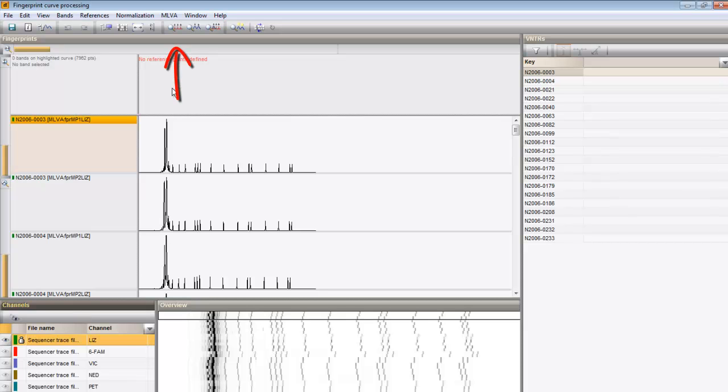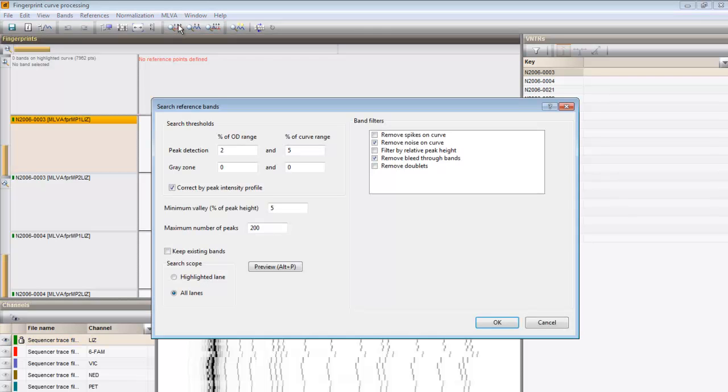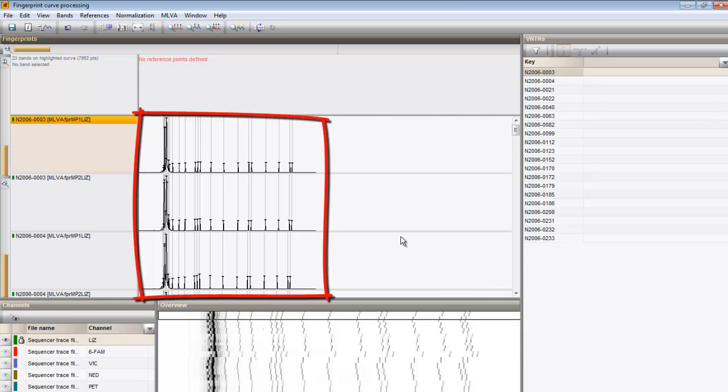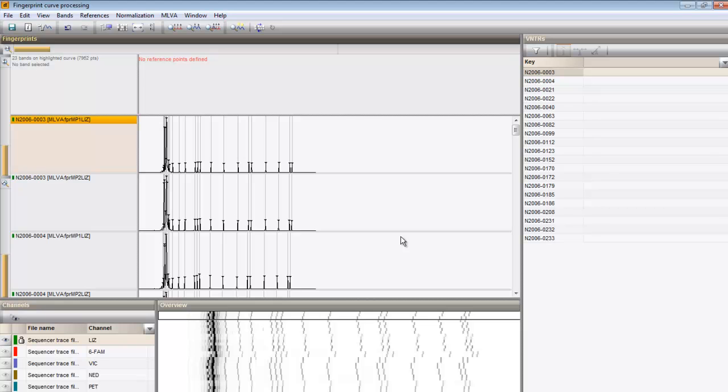Click the Search reference bands button, leave the default settings and click OK. The bands that fall within the specified criteria are marked with a solid line at the band's position.